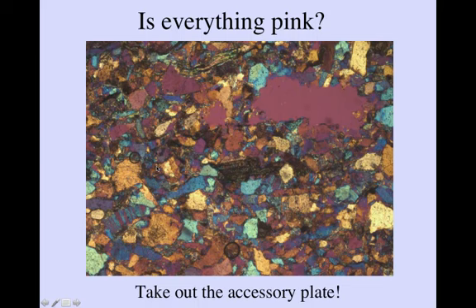Now, it's useful, but if you forget and leave the gypsum plate inserted, or you accidentally bump the gypsum plate and it is inserted, your thin section is going to all of a sudden look very pink or kind of violet, and that's not good because then you're not seeing the true birefringence in the minerals, and that's going to prevent you from correctly identifying the minerals. So remember to take that gypsum plate out after you're done either determining the sign of elongation or checking the order of interference color.